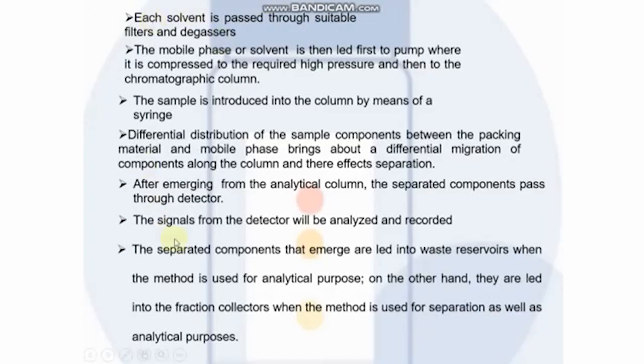So these things were already discussed in the instrumentation part in the previous slide. So these are the different processes carried out in HPLC.